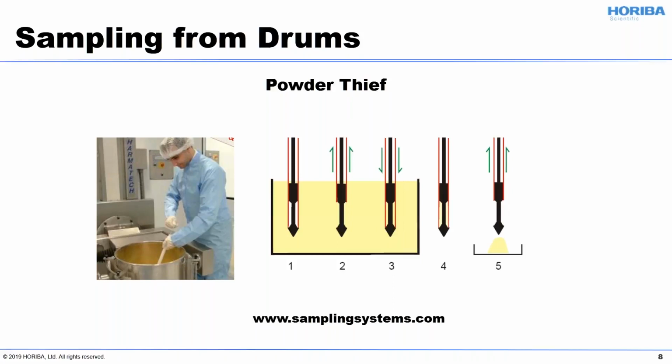I was once talking to a geologist, and he said that he would have to dig holes at multiple spots on the beach in order to get a representative sample of the sand. I don't know the details, but whatever the application, there's some thought given to getting something representative.